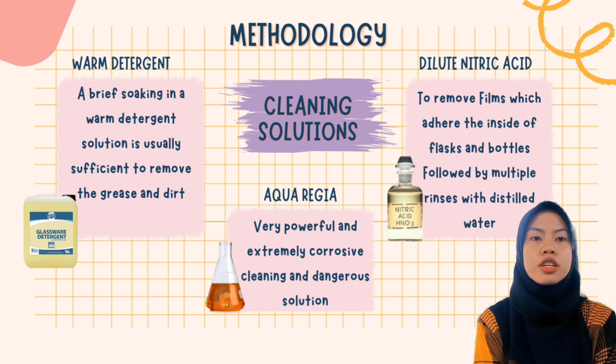The second one is aqua regia. Aqua regia is a very powerful, extremely corrosive and dangerous solution. It is not typically used for routine cleaning of glassware, but rather for specialist purposes such as removing stubborn contaminants or dissolving certain metals. The third one is dilute nitric acid.